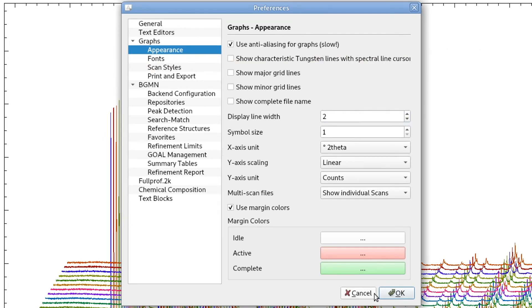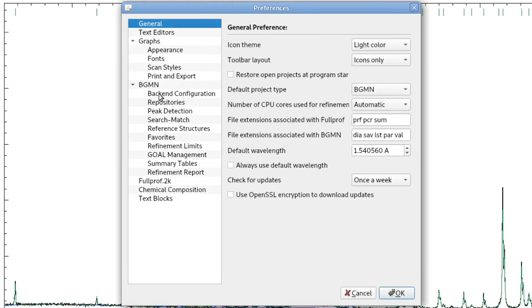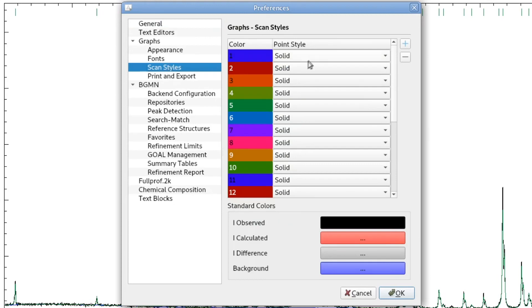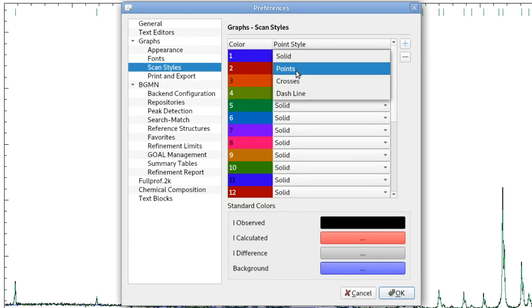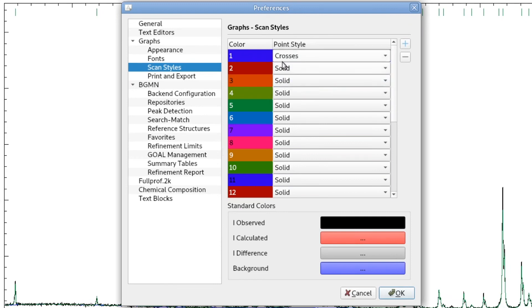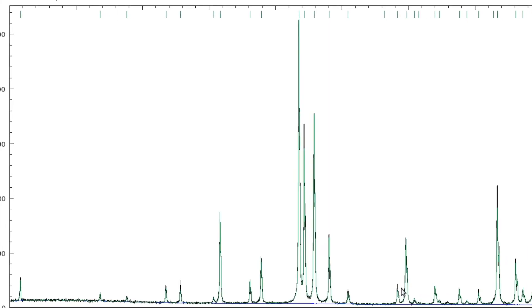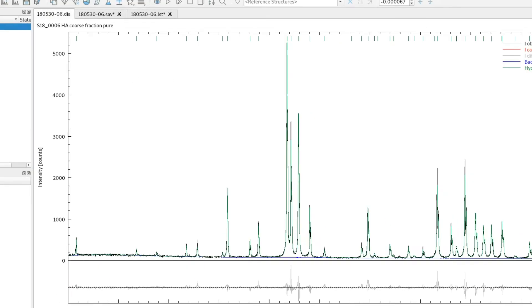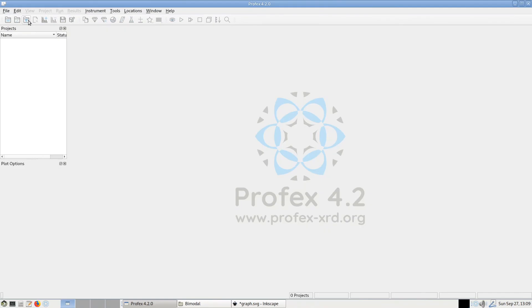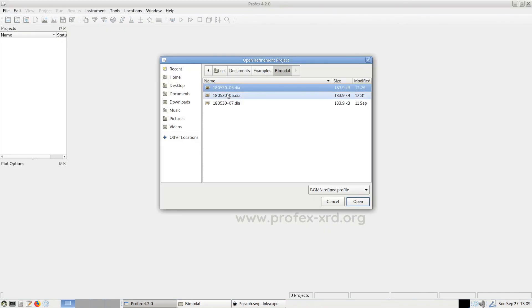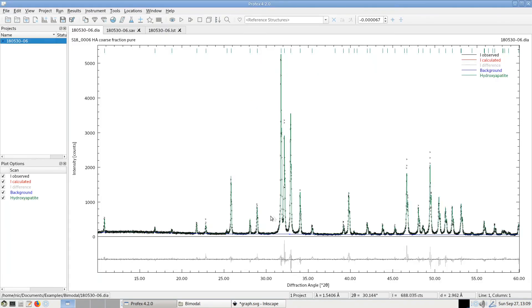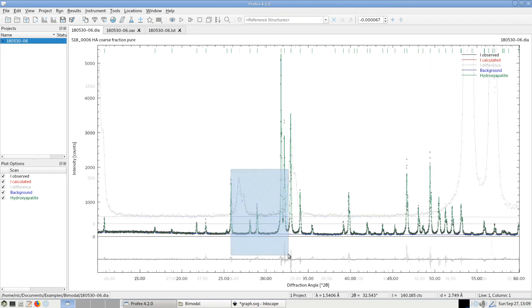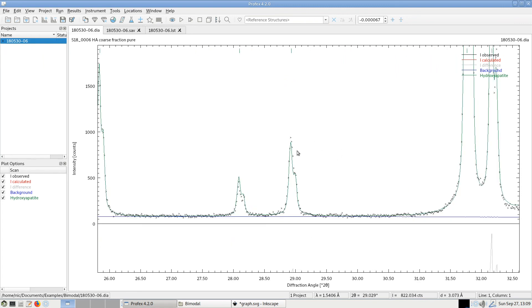And sometimes we want to change the line style of some scans. For example, some users prefer to draw the measured scan not as a solid line, but, for example, as points or crosses of the individual data points. We can change the point style of the first scan to crosses. Then we have to reload the project to apply the setting change. And now the measured values will be drawn as crosses not connected with a solid line.